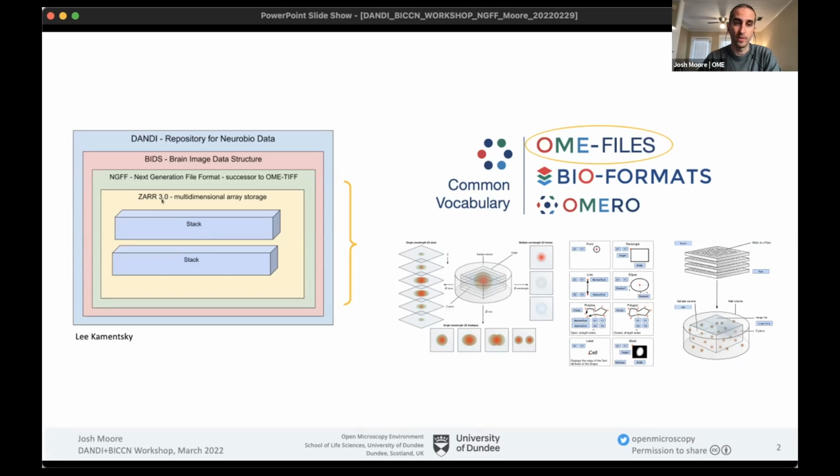The primary file format we offer is the OME-TIFF, which Julian talked about, so a lot of this I might not even need to say. There are some dozen to 24 microscopy companies that can export that. And it's worked fairly well over the years, but especially as we start to get into large 3D volumes, it's breaking down. Also, for many years we've been told by parts of the user community to just move to HDF5, and the microscopy vendors have said, no, don't do that. So we felt a little bit in the middle of everyone here.